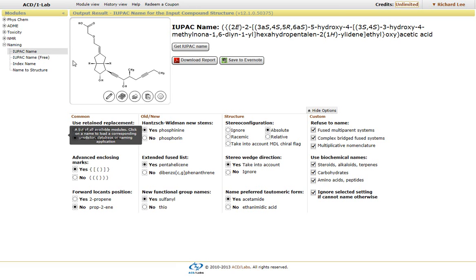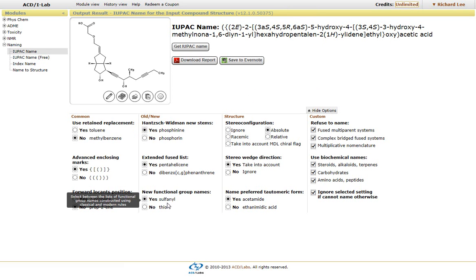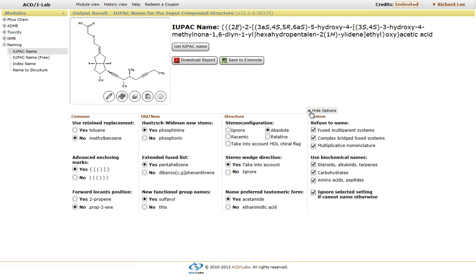This is the IUPAC name. Within the interface, we have the option of setting certain parameters, and these all follow the IUPAC convention. Our naming algorithm is the gold standard within the industry, as our main developer is part of the IUPAC naming committee.